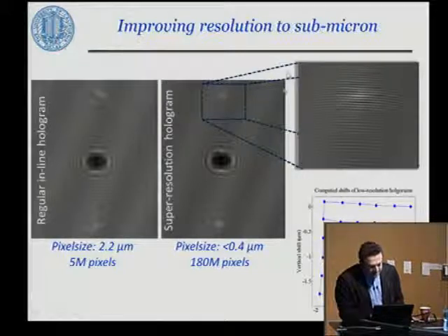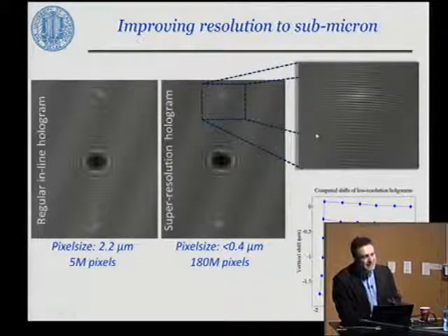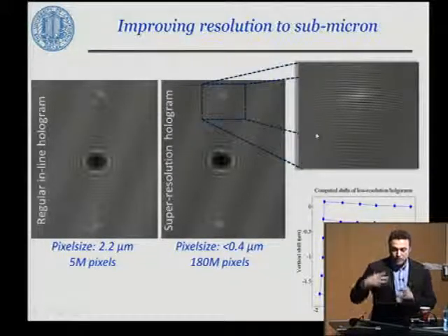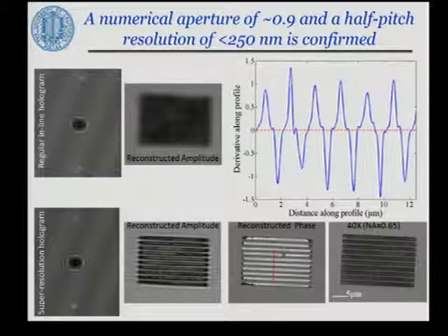At the end of this process, some of these fringes that are normally washed away because of pixelation start to come back. Those rapid oscillations that are retrieved here correspond to higher numerical apertures, which led us to reconstruct higher spatial frequencies that are normally washed away. This is a good example, which is coming from a very old sensor, just to show the proof of concept.